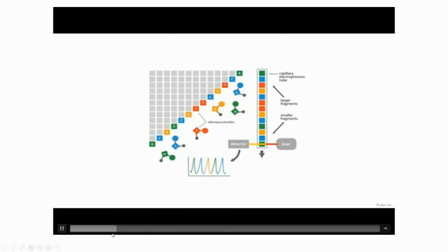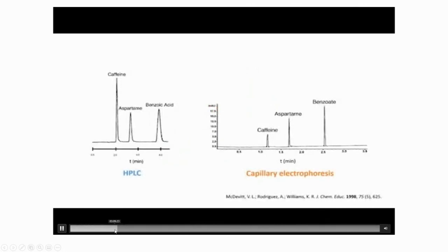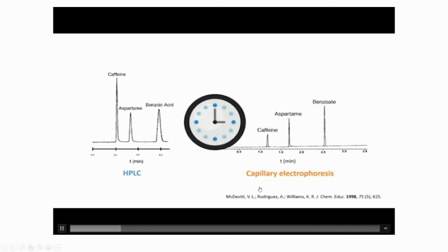Process, which is an even more powerful tool as compared to the conventional. We have a typical chromatogram obtained from HPLC, and on the right-hand side, we have an example of an electrophoregram obtained from CE. Now, pause this video for 1 minute.